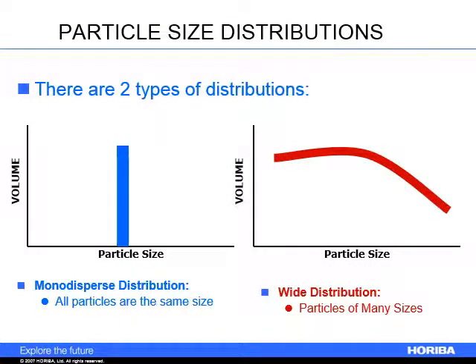For particle size distributions, there's really two types of distributions. Obviously, you can have combinations of many things, so they don't look this simple. But in a simplified basis, when you have a population of things that is really, really carefully milled or really highly prepared, something like pharmaceuticals or polymer dispersions, which are used for measuring standards for particle size, they tend to be monodisperse.